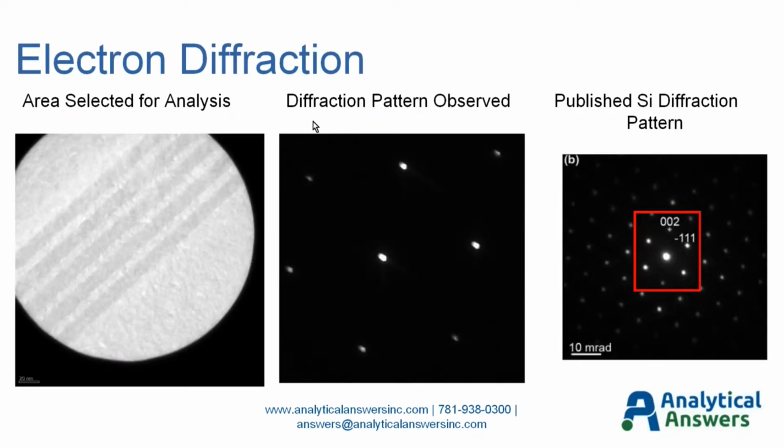So as we saw in the lattice image, we look to have complete epitaxial growth, and we can verify that using electron diffraction. And what I show here then is another image of this sample. The dark ring you see is the actual projection of an aperture that's been inserted into the beam to just select this portion of the field of view for diffraction analysis. There are a variety of aperture sizes, and combined with whatever magnification is necessary to see the field of view of interest, we can change the amount of material we include in our diffraction pattern.